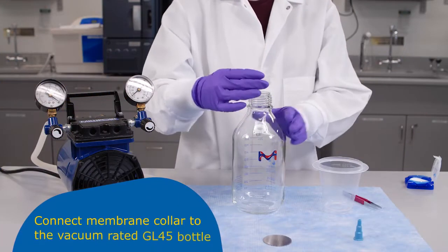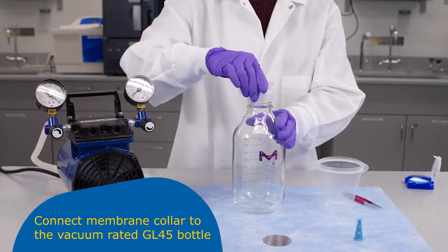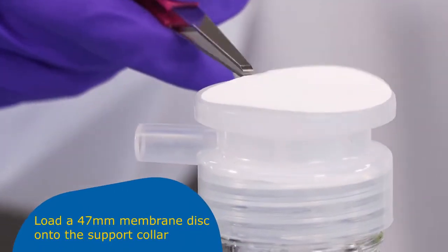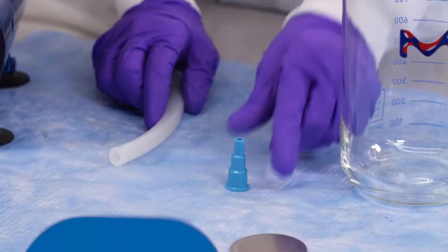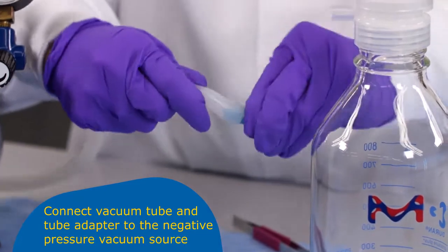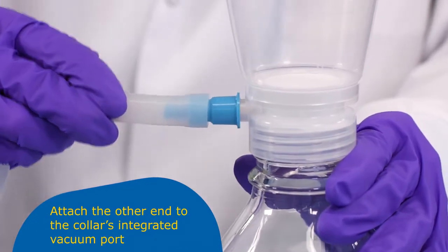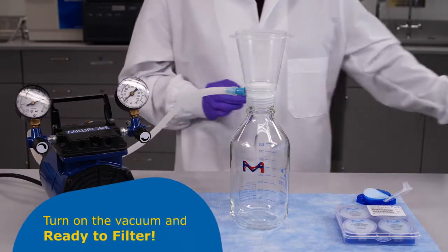To use your Millicup Flex, screw the collar into a GL45 vacuum-rated receiving bottle. Place a membrane onto the collar support and snap the pouring funnel in place. Connect the vacuum tube and tube adapter to the negative pressure vacuum source, then attach the other end to the collar's integrated vacuum port. Turn on the vacuum and introduce the fluid as shown here.